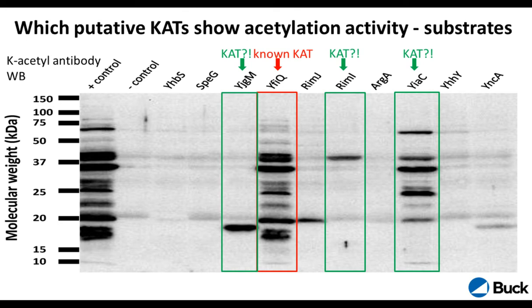What was nice, this was a known acetyltransferase, and you can see how that has a really nice acetylation pattern over, say, your vector, your control setting here. And then you can see there were some transferase candidates that were more promising than others. So we chose those and now submitted those for our mass spec workflows.